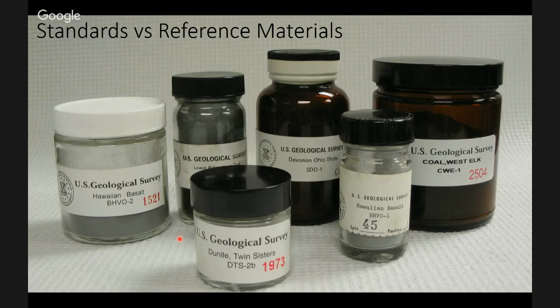And this is basically just a lump of basalt from outside the door of the Hawaiian Volcano Observatory, and they've ground it up into a powder to make sure it's really, really well mixed. So every little pot should be geochemically the same. And these have been measured by a whole bunch of different labs around the world. And there are agreed values for the concentration of different elements, of different isotope ratios.